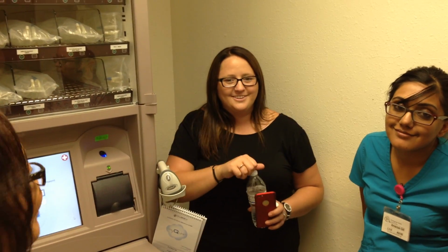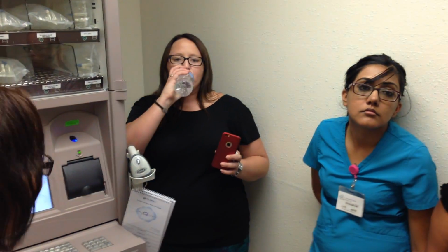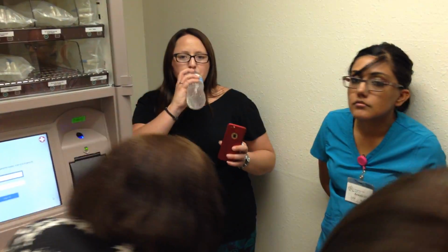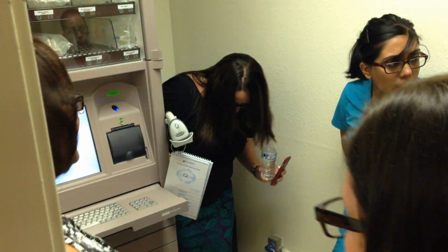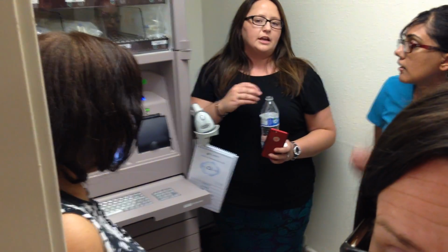In an emergency, when the power goes out, you said there's a battery on it, but for how long? Only 1 minute. However, one of your responsibilities is to make sure somebody gets an extension cord and plugs it into an orange or red outlet. It's about 20 feet away, so we need to make sure we have a cord long enough. We should probably have its own emergency cord in here, which we should, but we don't.